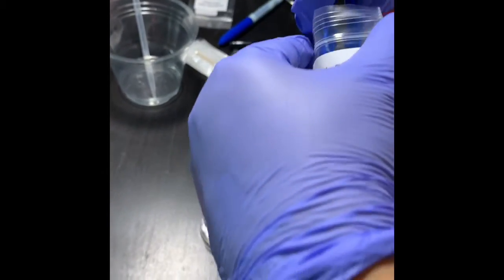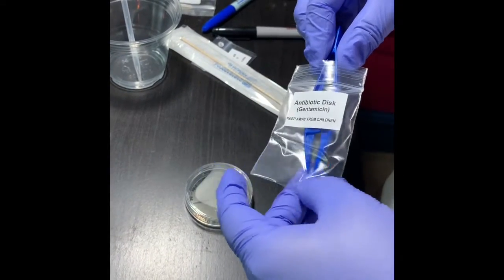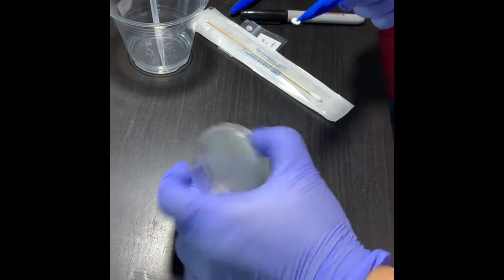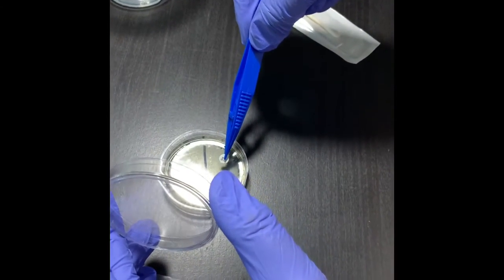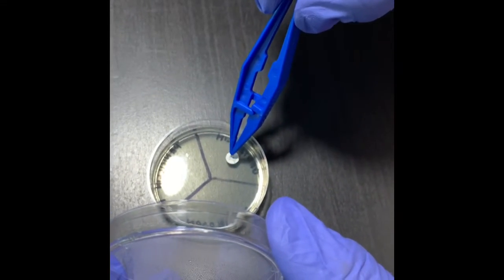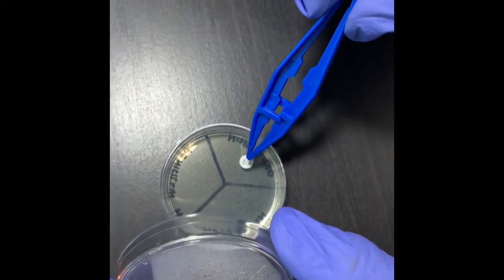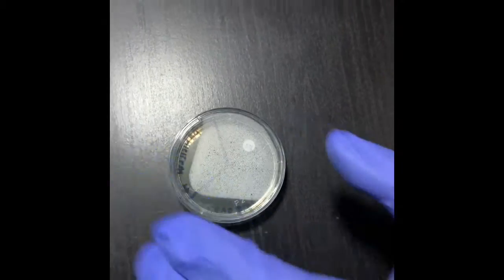I will carefully go inside and take this tablet. I look at the back and put the gentamicin at the center of the area where it is written gentamicin. I'll press a little bit so that it sits well. Don't press it too hard.